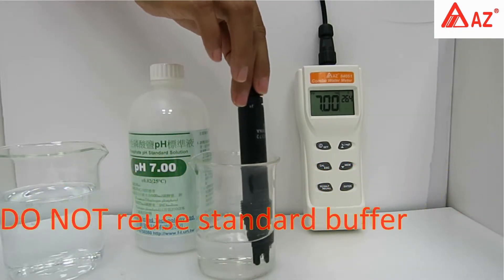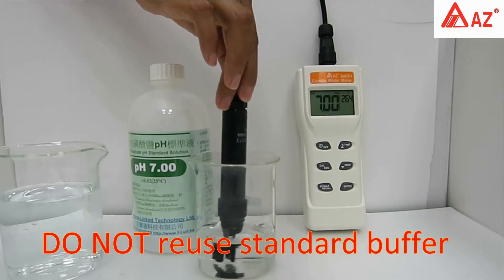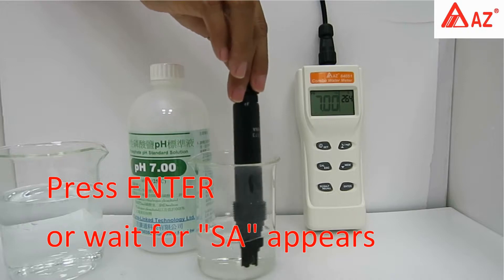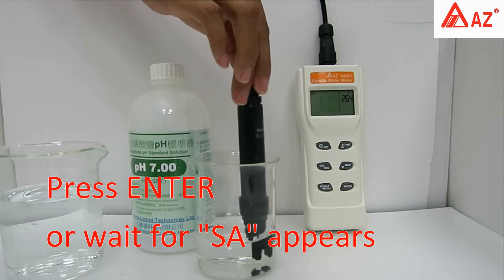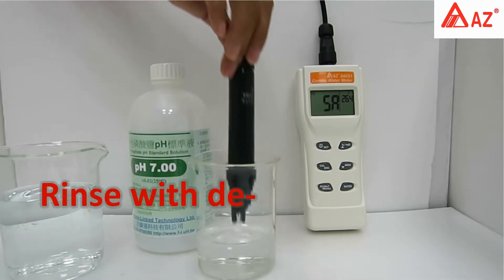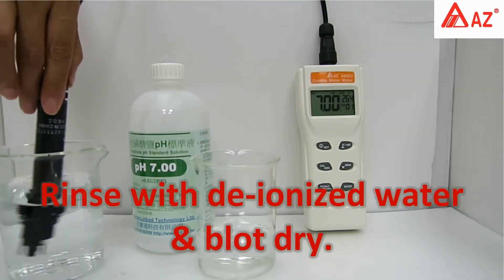Do not reuse the standard buffer. Once the reading stabilizes, press Enter or wait for the 'SAVE' icon to appear when the result is automatically saved. Rinse the probe with deionized water and blot dry.